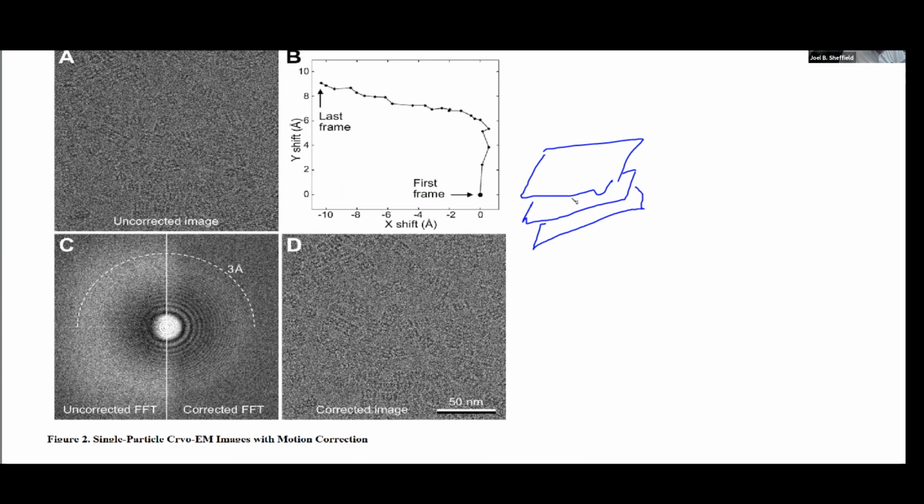And again, realign them so that all of these are lined up in the same place, so that you would be able to say, well, what I really have is a set of identical images. Now that I have this set of identical images, I can look for the things that are common in it.